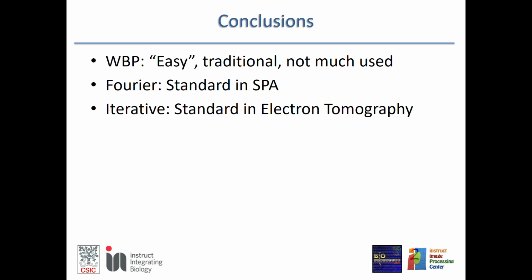These constraints in single particle analysis don't apply so much because we have so much data. But in electron tomography they can play a role, maybe not the ones of symmetry and being defined inside the mask.